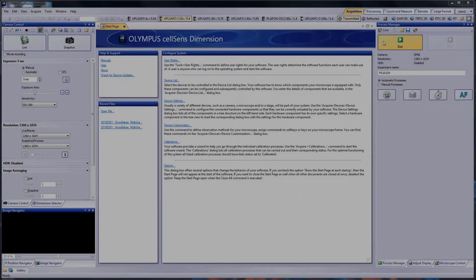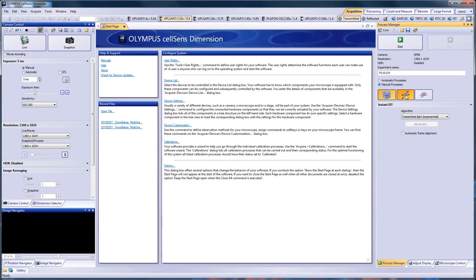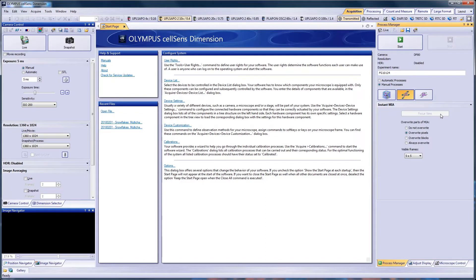To create an Instant MIA image, use the Process Manager tool window. Select the Manual Processes option and click the Instant MIA button. The Focus View button will become active after the acquisition process starts. Use this button to adjust the sample's focus during the acquisition.